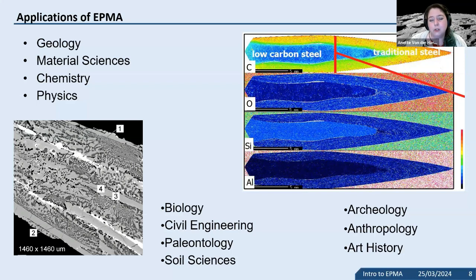So biological materials are usually not easy to analyze if they contain any kind of moisture, because we run these instruments at a high vacuum, but otherwise everything that is solid and can sustain a beam is possible.